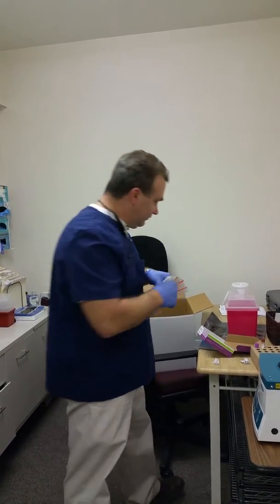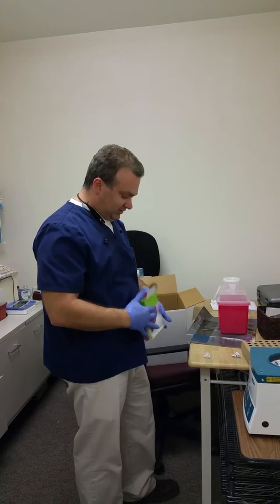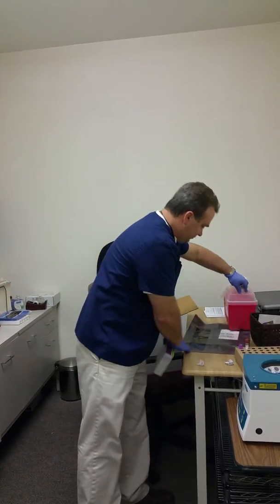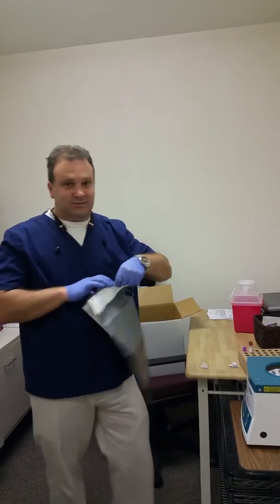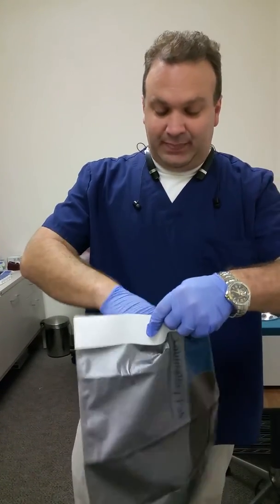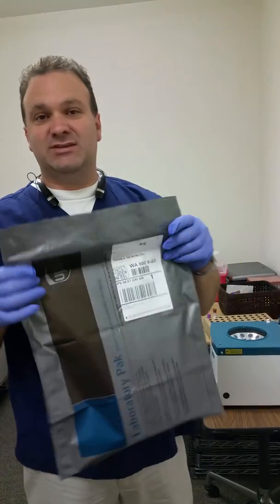So there's the one bag — it's going to go into this little box, gets closed up. And then it just goes into the outside bag. That way you have two barriers with it. And that's about it. Thanks.